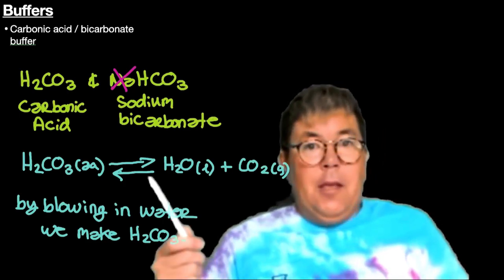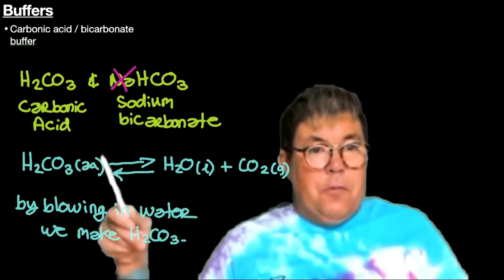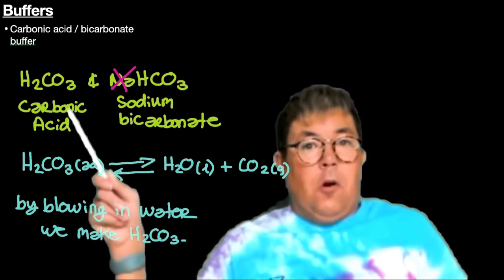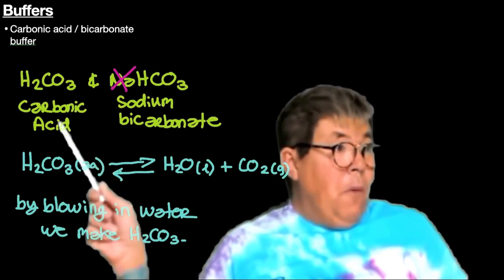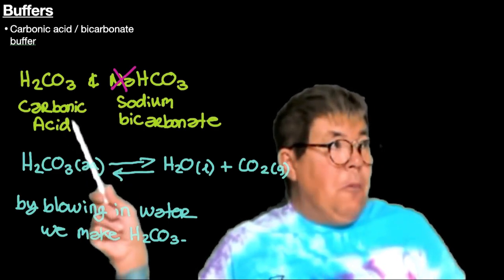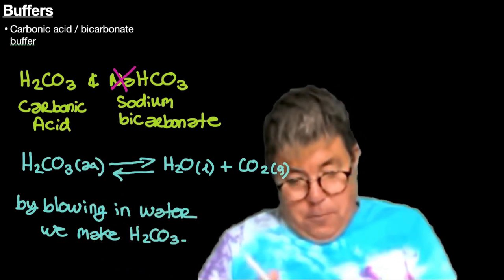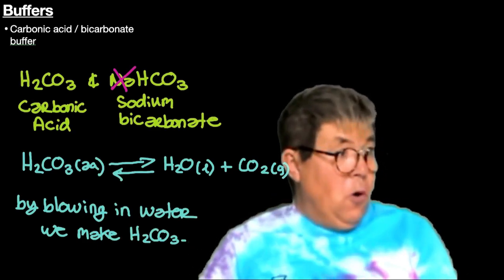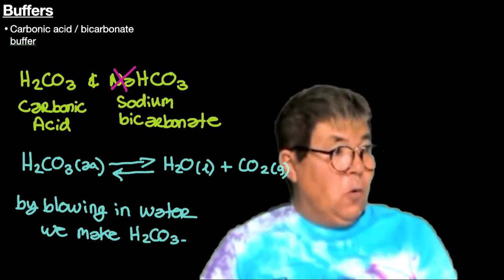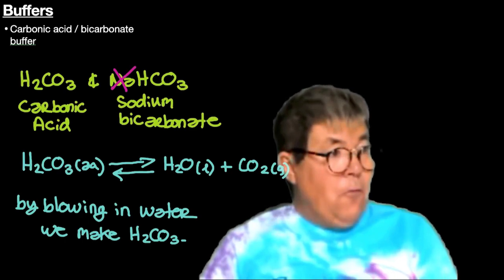So not only is carbon dioxide a byproduct of respiration, but it also forms carbonic acid in our bloodstream that will help create this natural buffer that will keep the pH of our blood relatively constant. So when we make this buffer solution, then we're going to add some acid, HCl, to the buffer. We're going to add HCl to deionized water for reference.